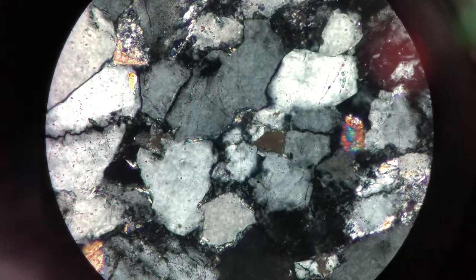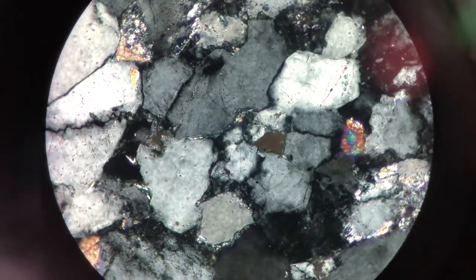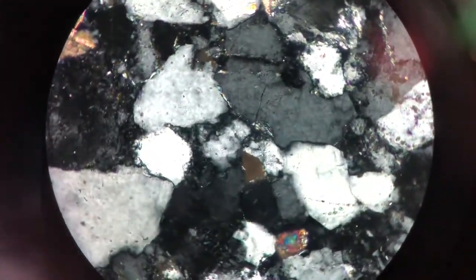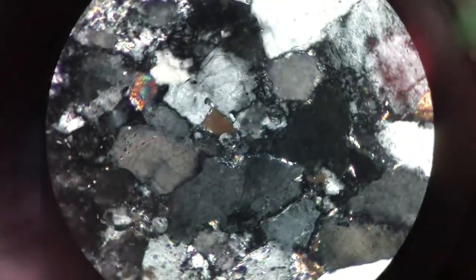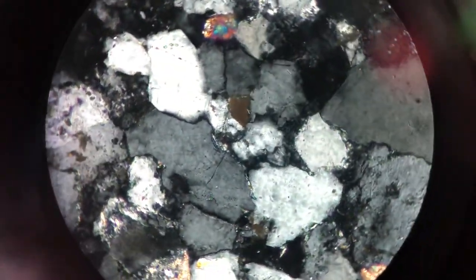Here, you see a correct XPL view of a quartz sandstone made up of rounded quartz grains, where the interference colors of quartz are light to dark gray and change four times when the stage is turned 360 degrees.